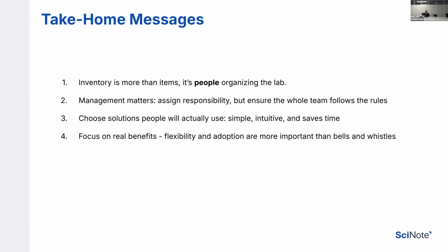Good. What I'm gonna do next is jump into the third poll. I want to hear your opinion. So I said in the beginning, this will be a 3-part series of webinars. Today, it was an introduction and we wanted to show a use case where inventories were used in a very complex system. But next time, we want to do a deep dive into more advanced features and more advanced use cases.